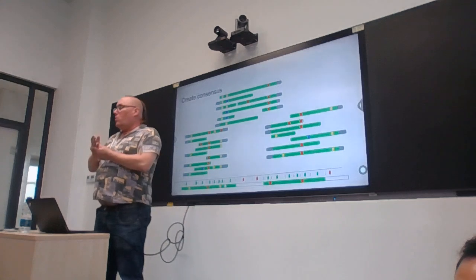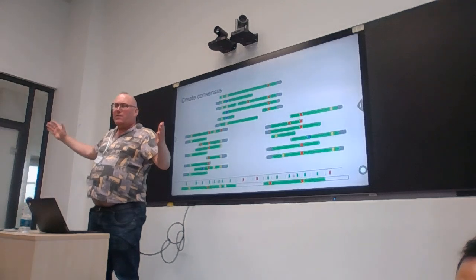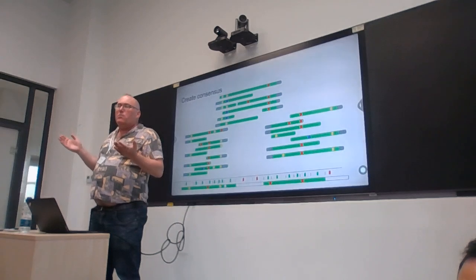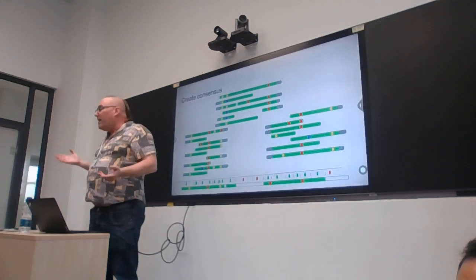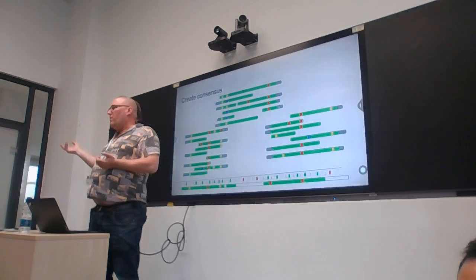So when you were doing your COVID-19 sequencing, you would not get 100% of the genome back. You would get, depending on what the CT value was, 80%, 90%, 95%. If you had a bad sample, you'd get 60%, and the rest would be missing because we don't have enough data there.